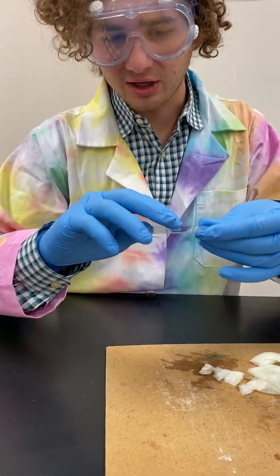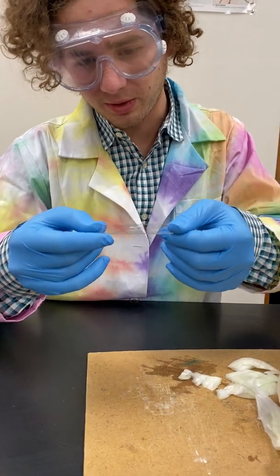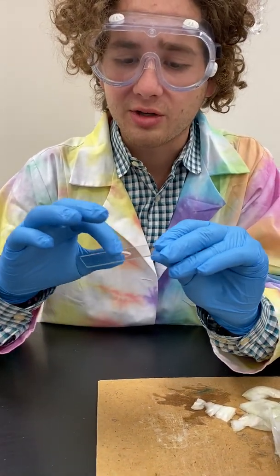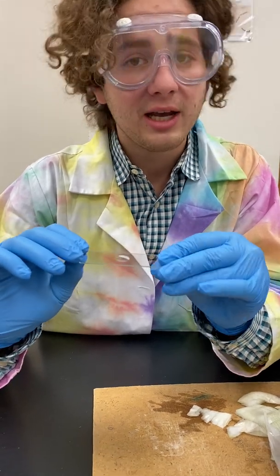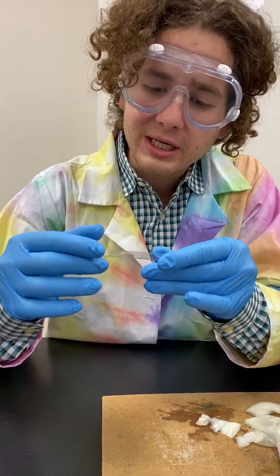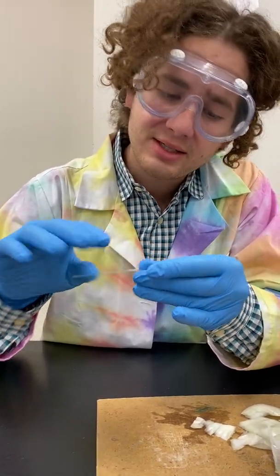Here we have some slides that are concave on one side, so that if you wanted to study something living in water, you could put that drop in a little well on one side and have a little bit of room to swim around. However, we're just working with onion skins today, so we want the flat side.